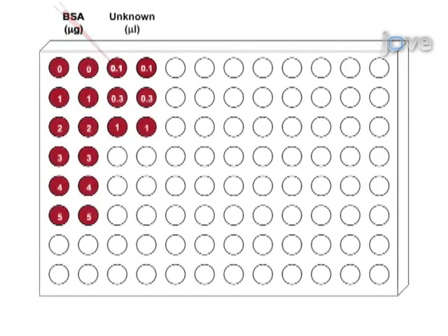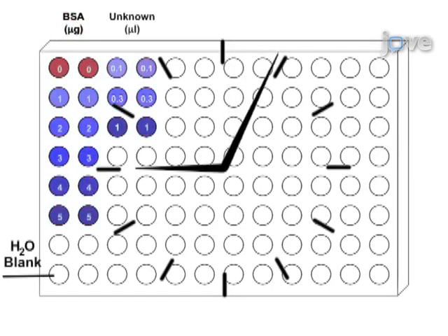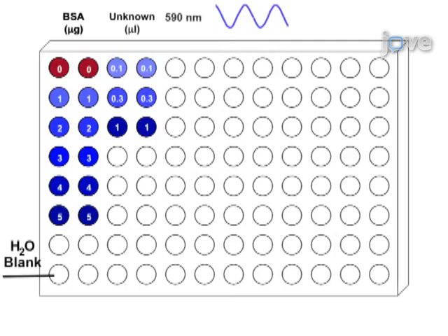The Bradford reagent is then added to all wells except for the blank, which must be water. After five minutes, absorbance is read at 590 nm for the detection of protein dye complex and at 450 nm for linearization of the graph.